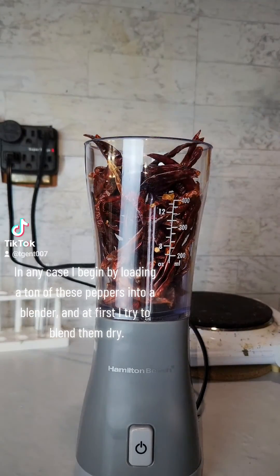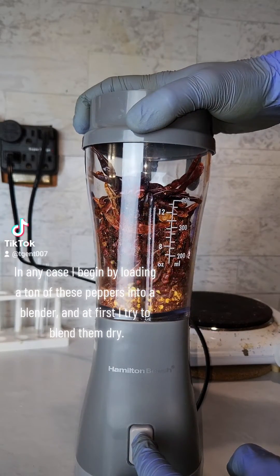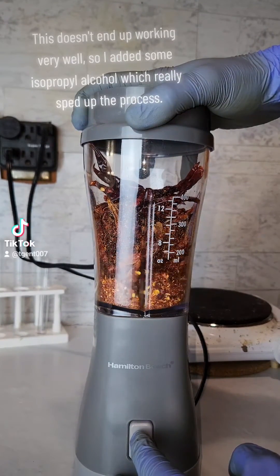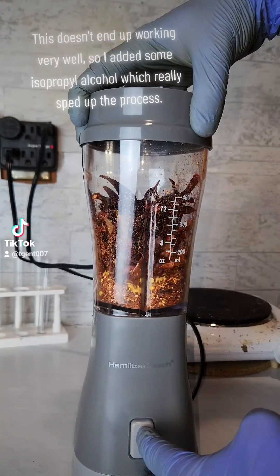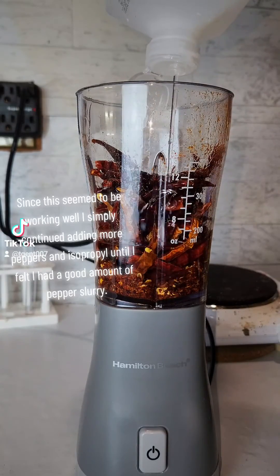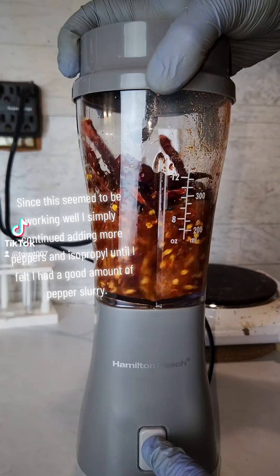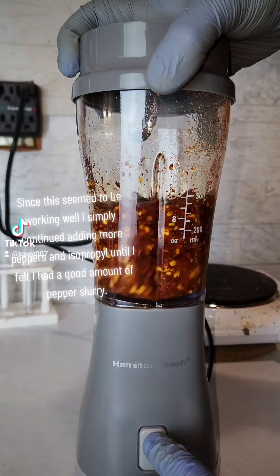I begin by loading a ton of these peppers into a blender, and at first I tried to blend them dry. This doesn't end up working very well, so I added some isopropyl alcohol which really sped up the process. I simply continued adding more peppers and isopropyl until I had a good amount of pepper slurry.